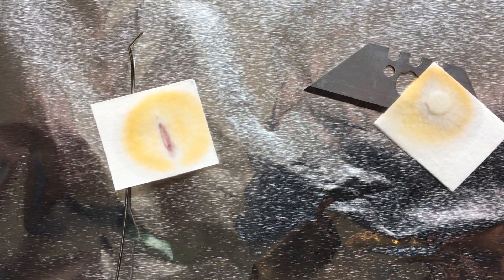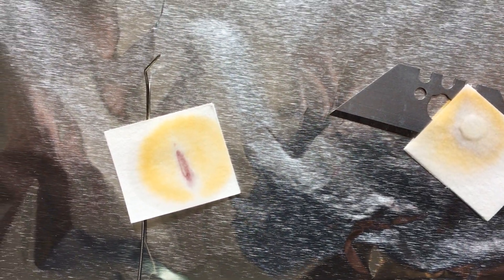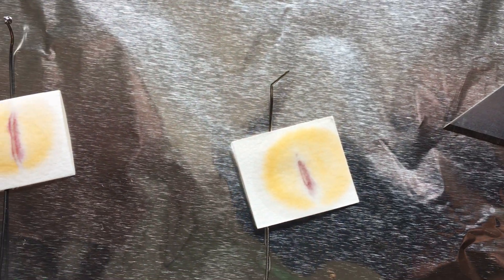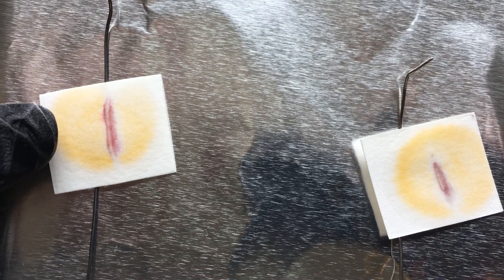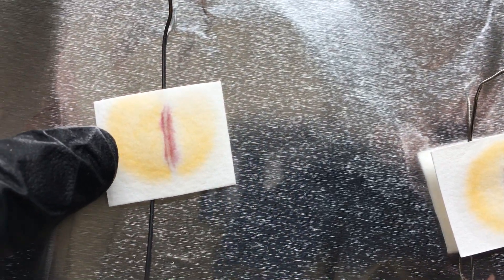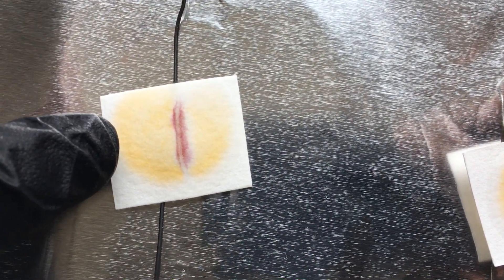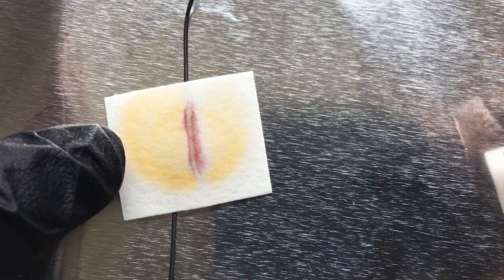But the leaded solder, you can see red in there. That has actual red, actual magenta. I think magenta is a more clear description than even purple. Without a doubt, it's clear.